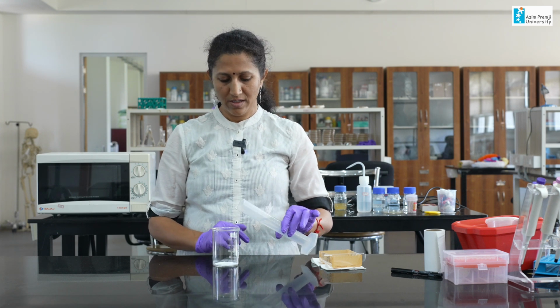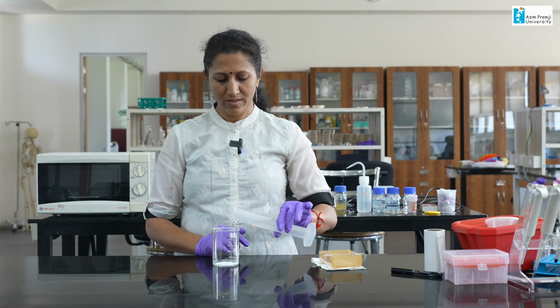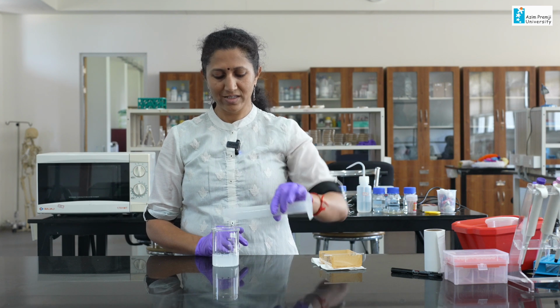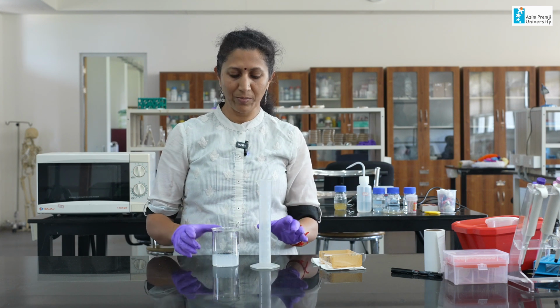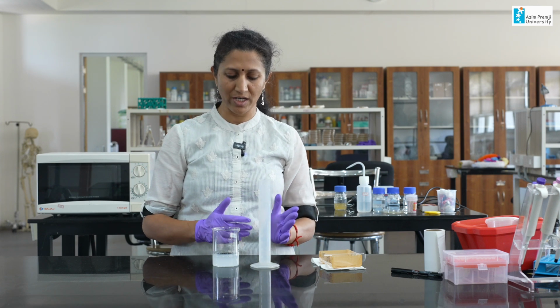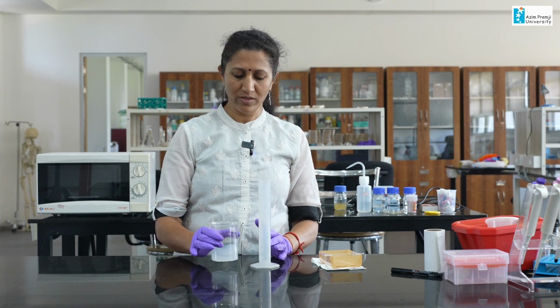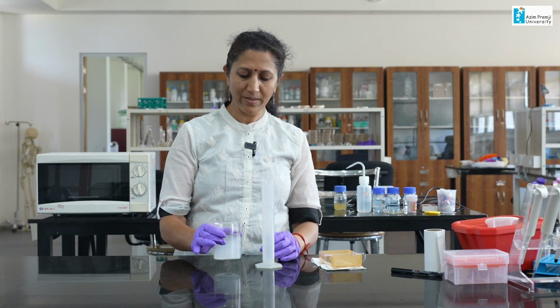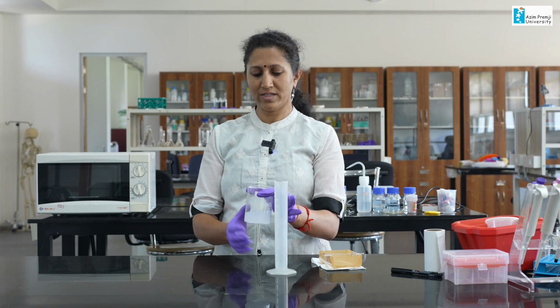To prepare that, I have to weigh the required quantity of agarose and then pour 1x TAE buffer. Usually we prepare it as 50x and keep it, and dilute from that whenever you need. TAE is Tris-acetate EDTA buffer. Then mix it thoroughly. I am going to keep this in the microwave oven now to boil it till it becomes completely clear.